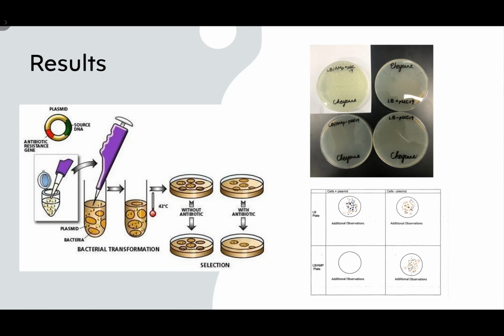Here comes the exciting results. As you can see, one plate exhibits blue colonies, while two other plates exhibit white colonies, which means our experiment has succeeded.